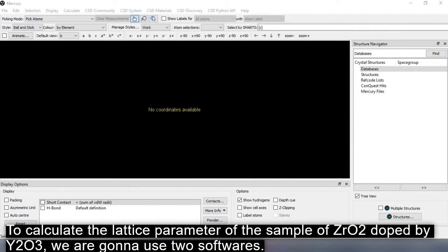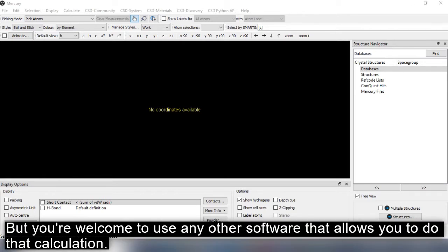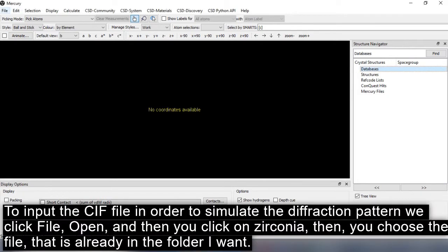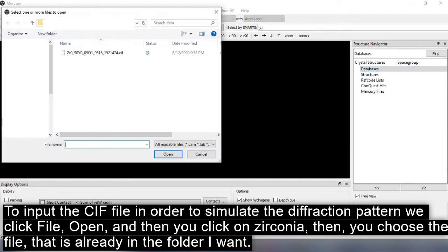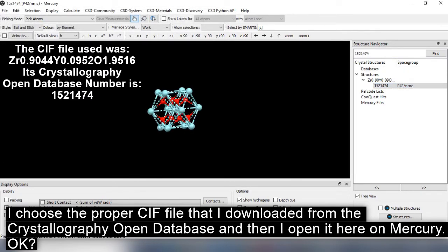To calculate the lattice parameters of the yttria-doped zirconia samples, we'll use two pieces of software. First, Mercury to simulate the powder x-ray diffraction pattern, and then Excel to do the calculations. To input the CIF file to simulate the diffraction pattern in Mercury, we click File > Open, then select the zirconia CIF file downloaded from the Crystallographic Open Database, and open it in Mercury.